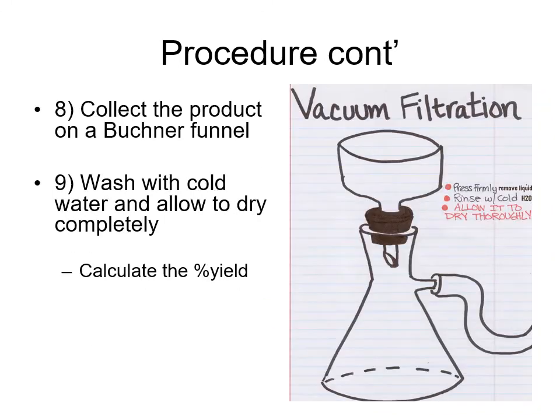Then it's time to collect your product. So you would use this setup as we've seen before. Of course, as always, please remember this needs to be clamped. The Buchner funnel goes on top with a correctly fitting adapter to the flask, and then you just pour your product through with a filter paper, of course, and you'll end up collecting your crystals up here. Make sure that you completely dry them, right? And then you take their weight and calculate the percent yield of recovery of the reaction.